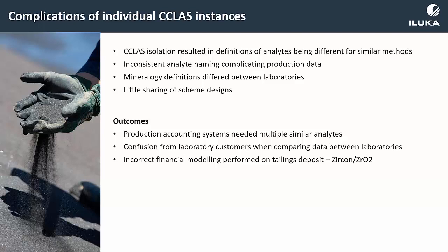So the outcome of that was that there was complexity all throughout. Production accounting systems needed multiple data pickups to accommodate the three labs. It could be difficult to compare results between laboratories because the assays that were reported might be slightly different in the techniques.